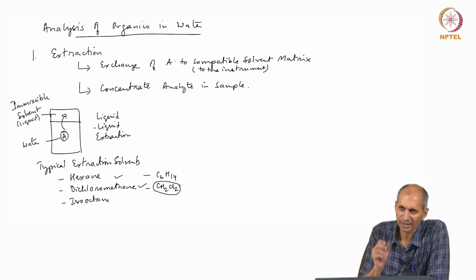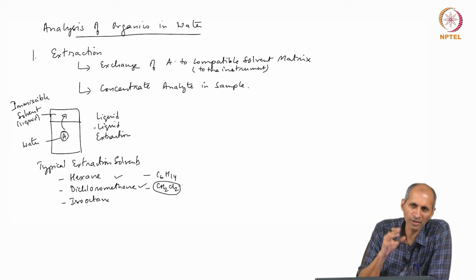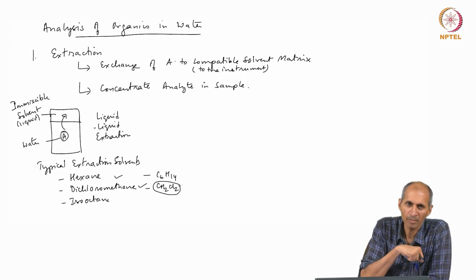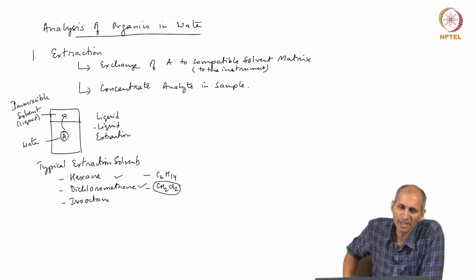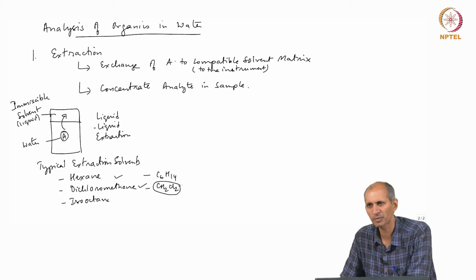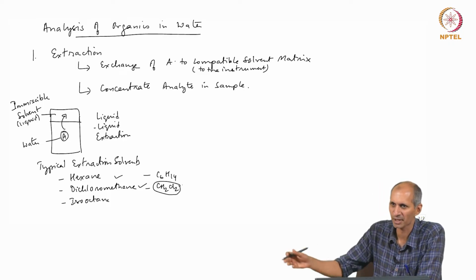Dichloromethane is a very hazardous compound. It is a chlorinated organic solvent, but it is one of the strongest solvents that there is. Many of the chlorinated organic solvents are very powerful. They will extract a lot of things. But if you look at the priority chemicals of concern, you will find some of them there because they are used in large quantities. So, the opportunity of exposure is very high. In industry, people use solvents for all kinds of things, painting, cleaning of things. It is a very good extractant. So, you want to clean something, it will come out very easily.